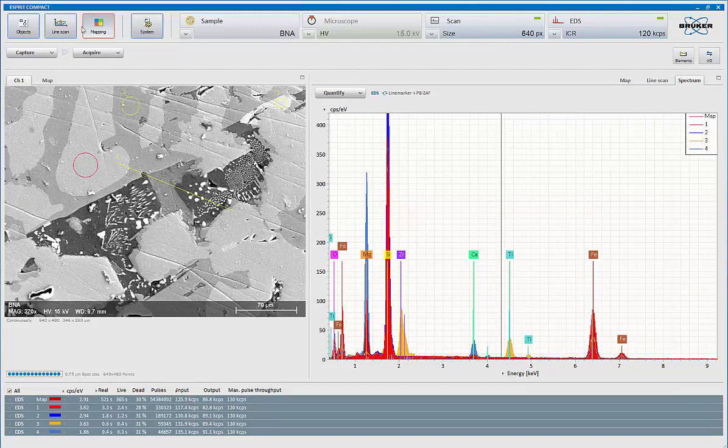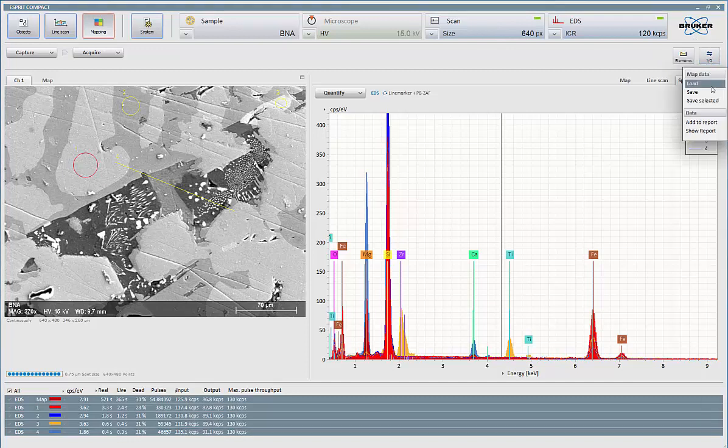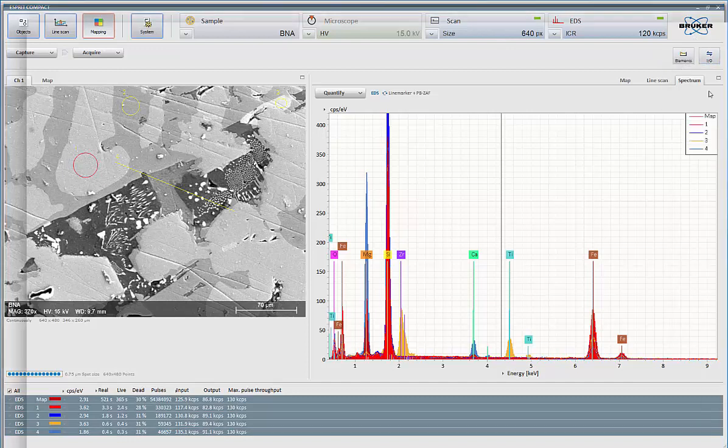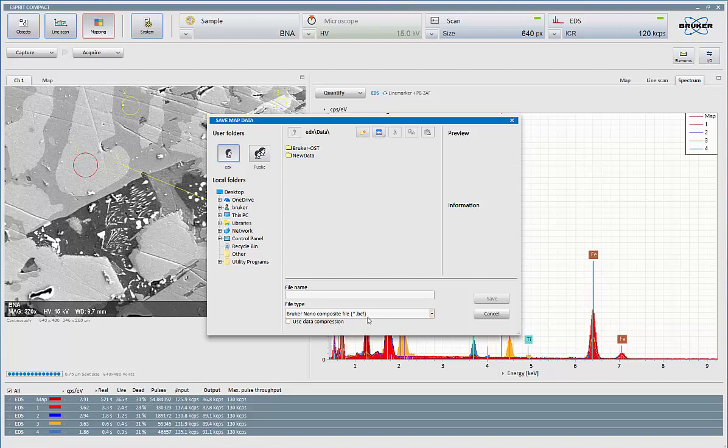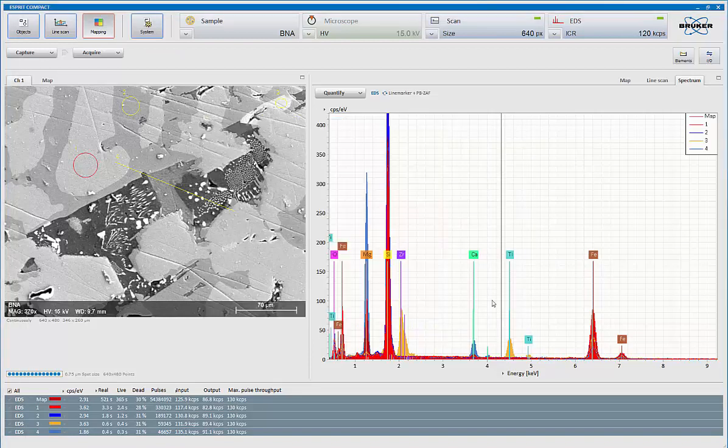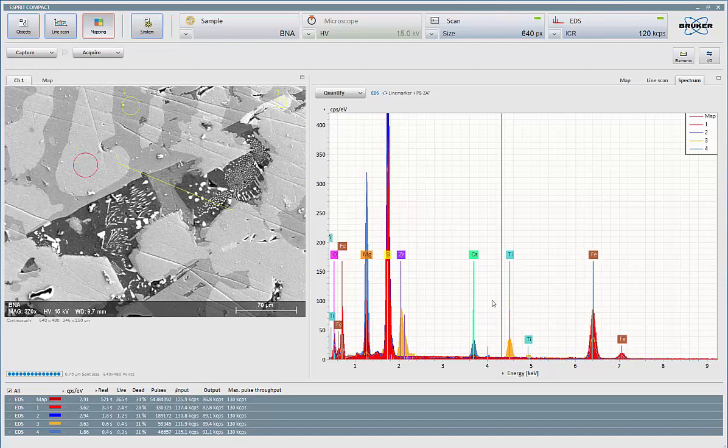Once I'm satisfied with the spectrum, stop the acquisition, I can then save all the data. Going to the in and out control, hit save. And this is saved then as a Bruker cube file or a BCF. I give it a name. And when I call it back, I'll still be able to add or extract new information from it at any time.